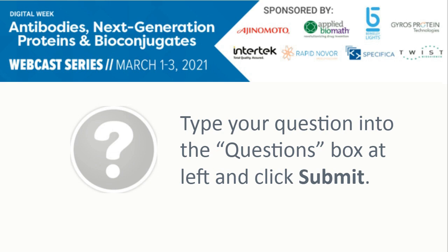Great, thank you. Next question. How many MABs do you get from rabbit from lab material? Yeah, great question. Like I said, it varies, but between 2 and 5 is kind of an expectation that we've been able to work with and deliver on thus far.